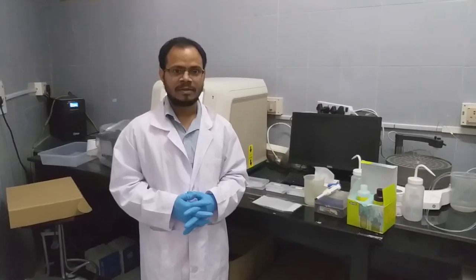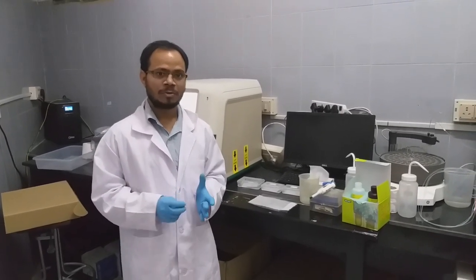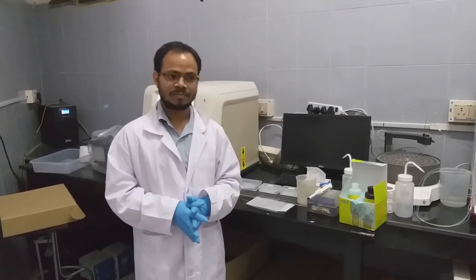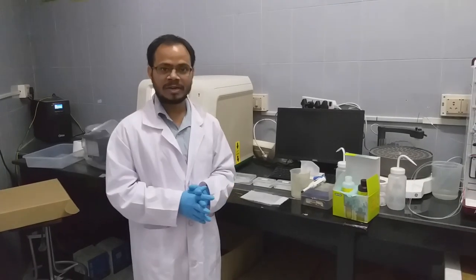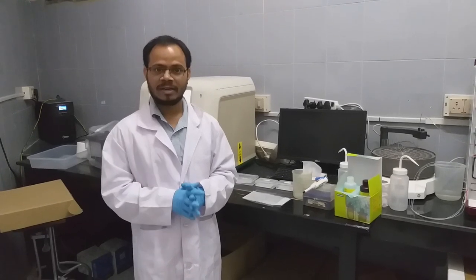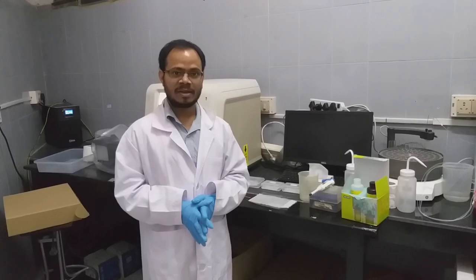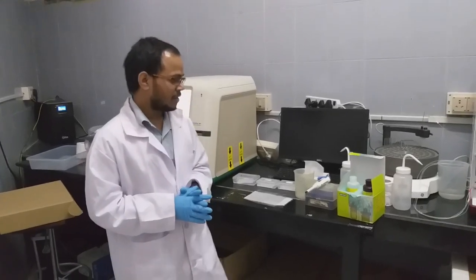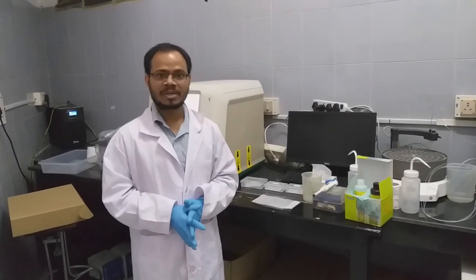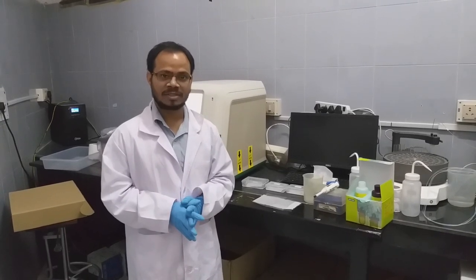In the earlier video on how to do Western blot, we showed how to transfer the proteins to the membrane, incubate with the primary antibody followed by the secondary antibody, and wash. Now here we show how to develop a blot. For developing a blot, we need a chemiluminescent substrate. In most commercially available kits, luminol is one of the substrates used for this purpose.